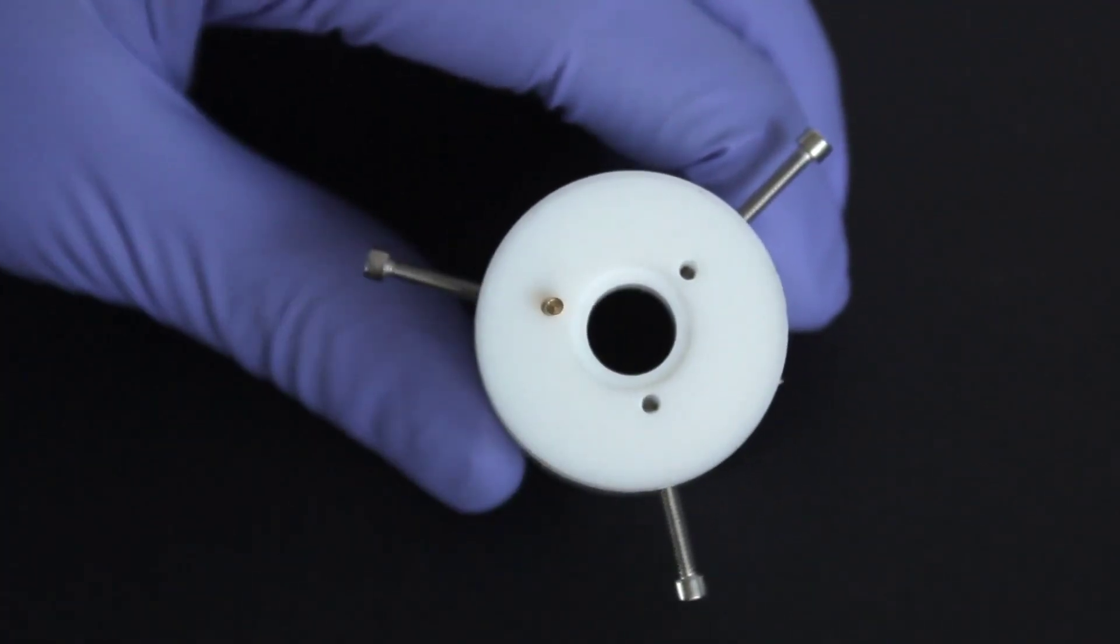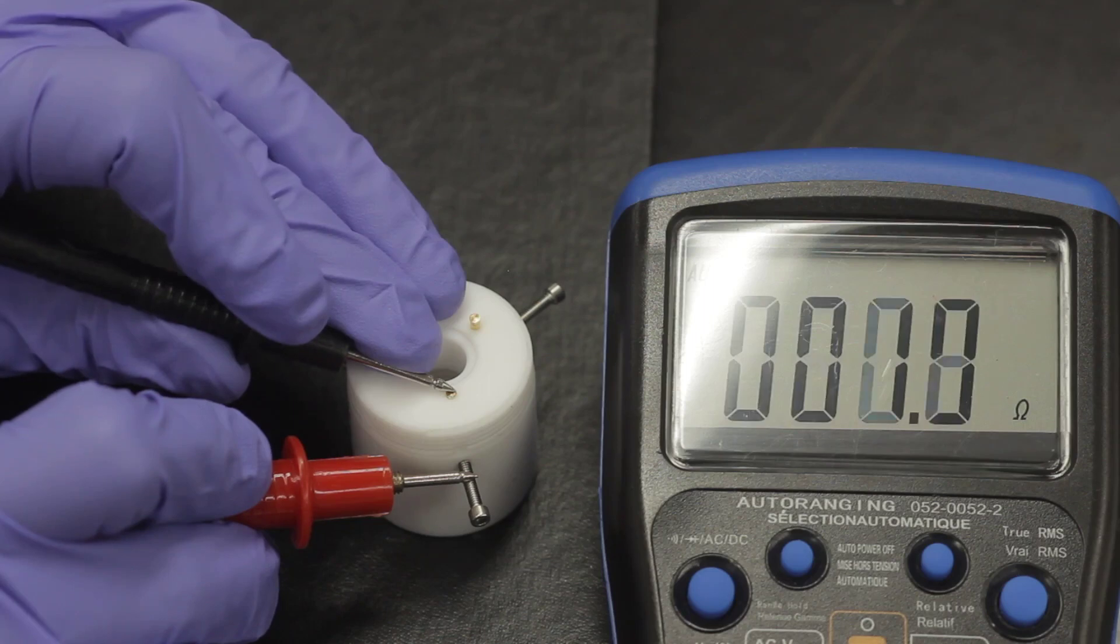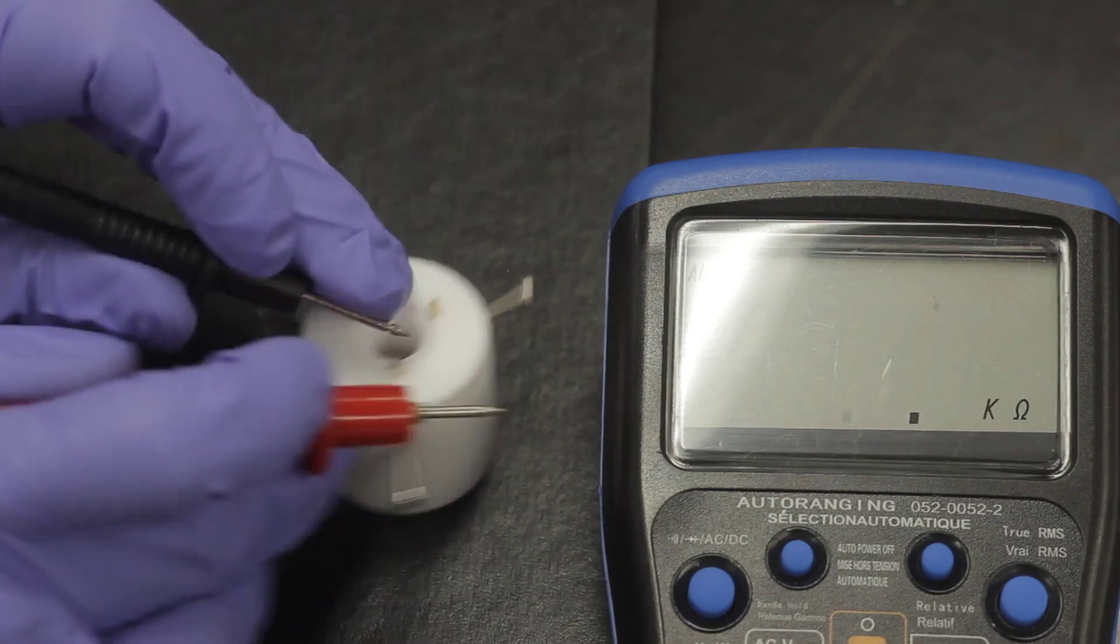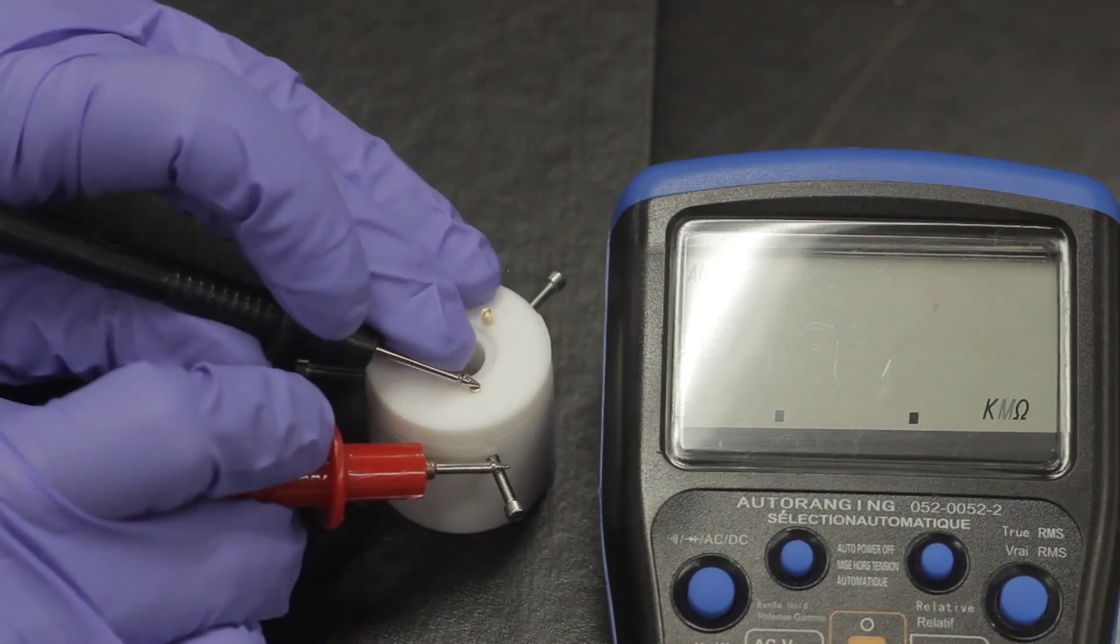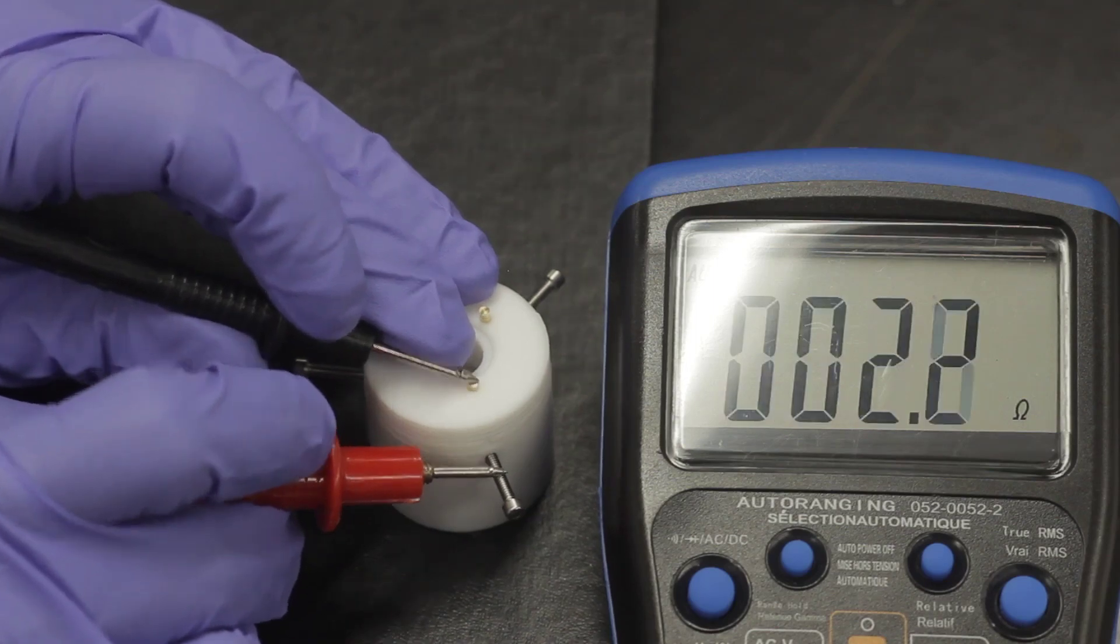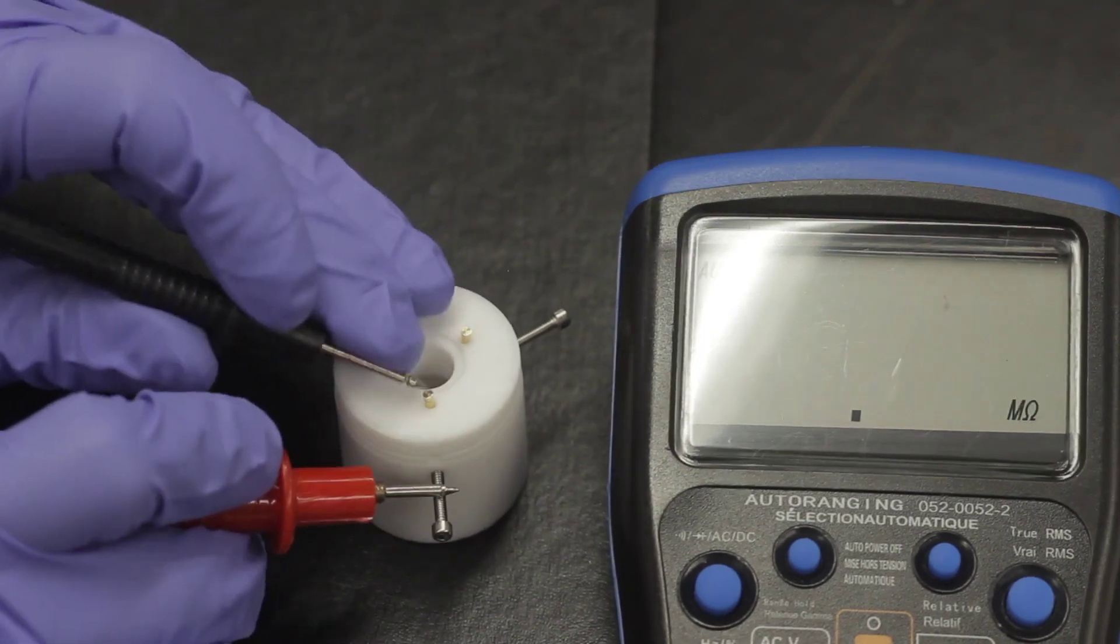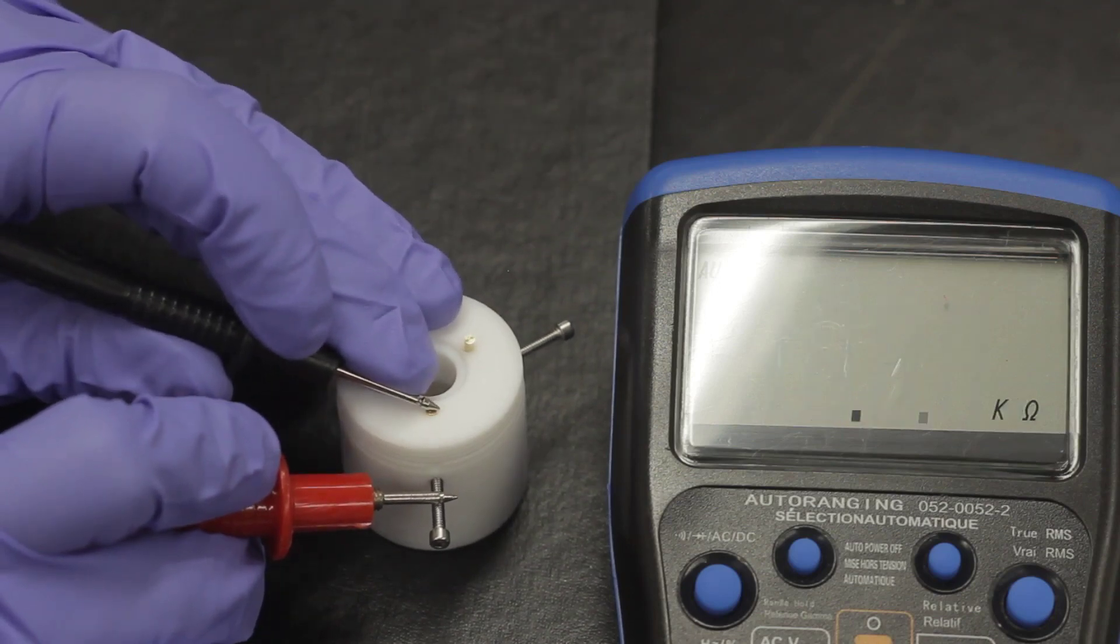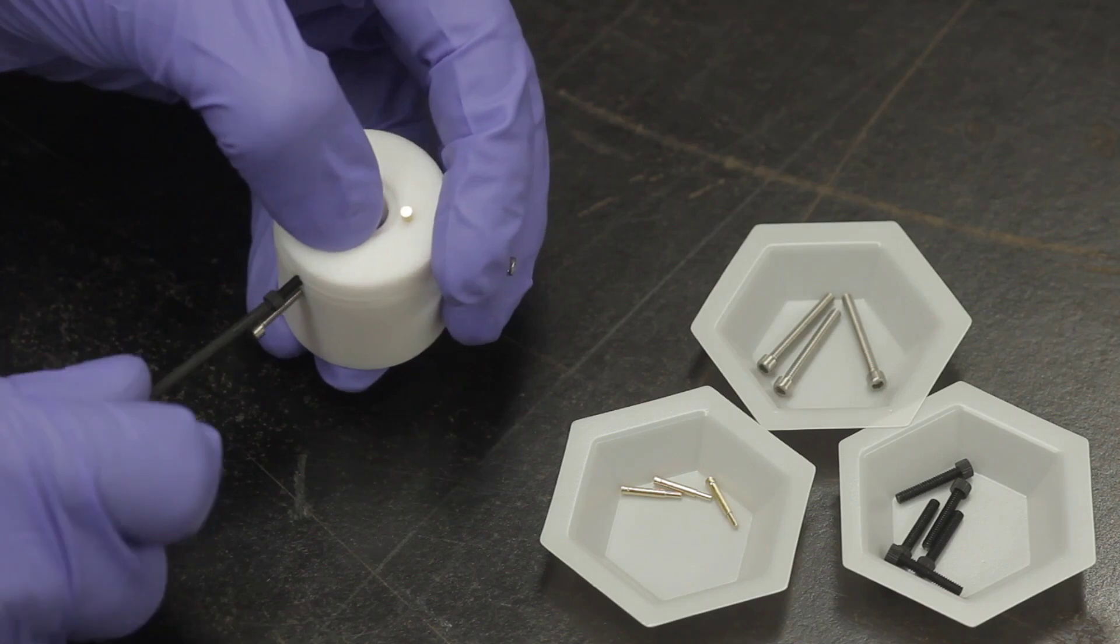Check the electrical contact between each pin and its corresponding stainless steel screw. This is easily done by measuring the resistance with a multimeter. The resistance should be under 10 ohms. If there is no electrical contact, remove the pin and screw, and blow some compressed gas through the hole to dislodge any foreign material which may be preventing contact.